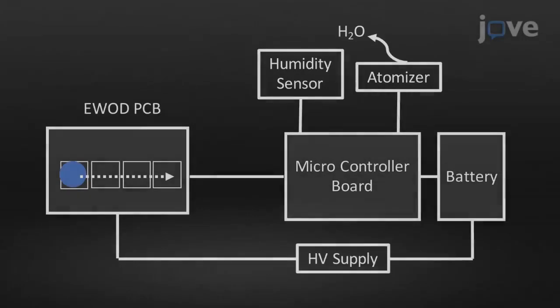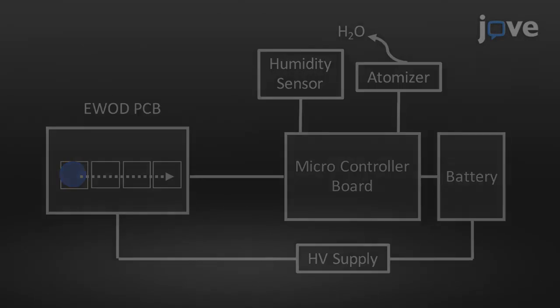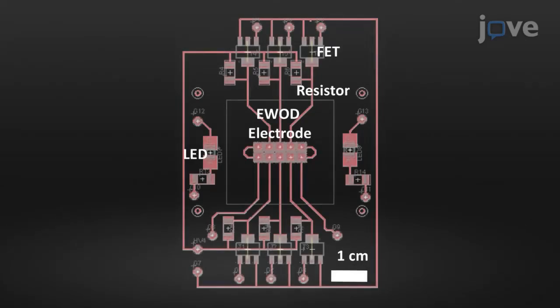We present a digital microfluidics educational kit based on a commercially sourced printed circuit board that allows the user to get hands-on experience with digital microfluidics. This is a viable, low-cost solution for education, provided that digital PCB design files can be shared.